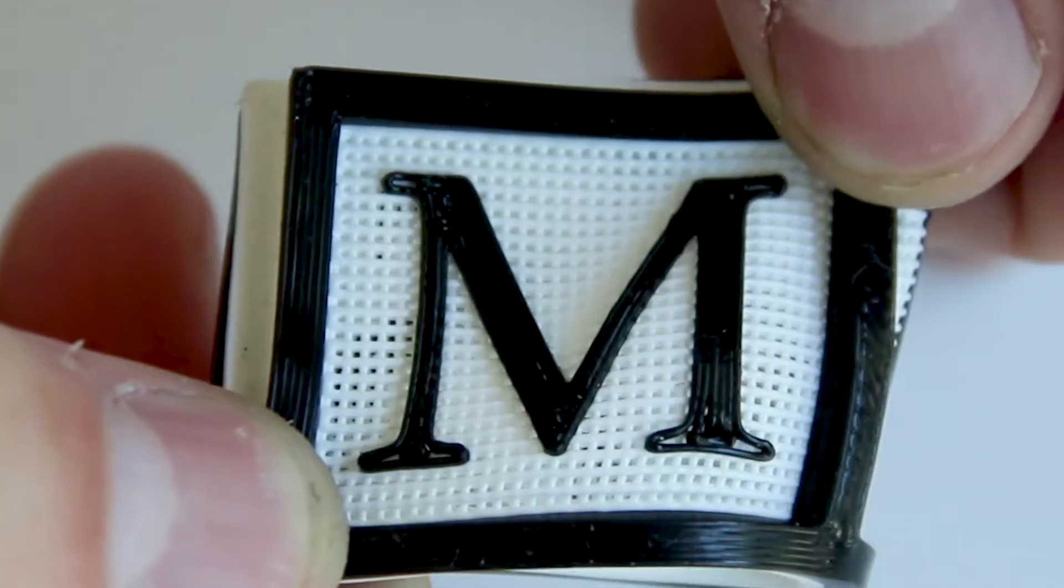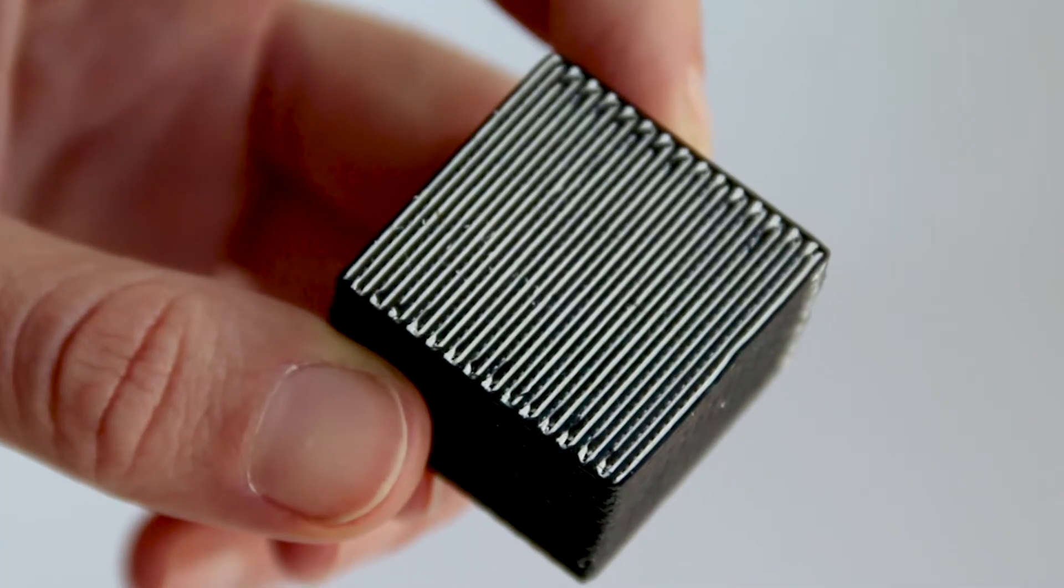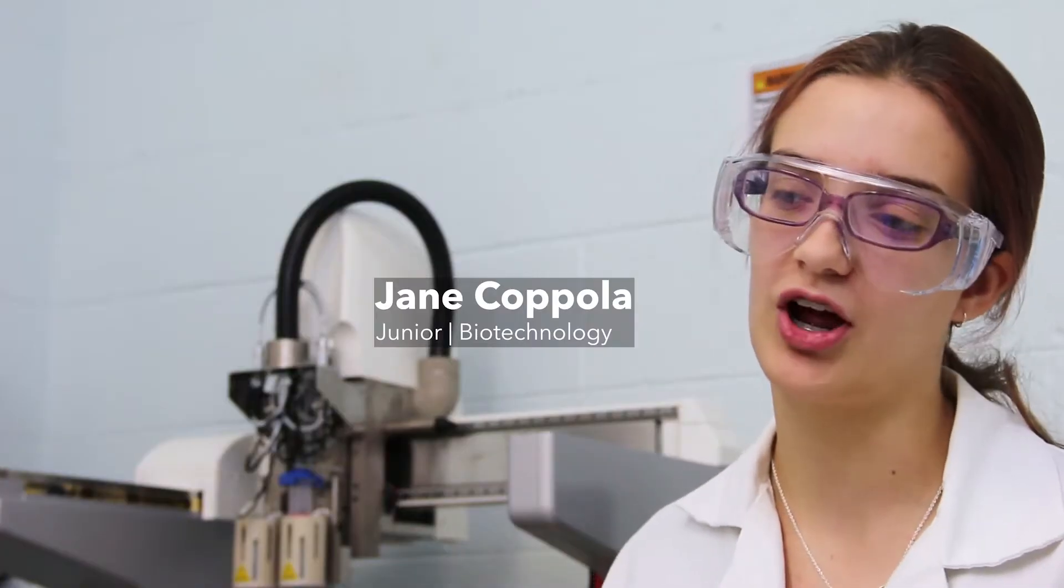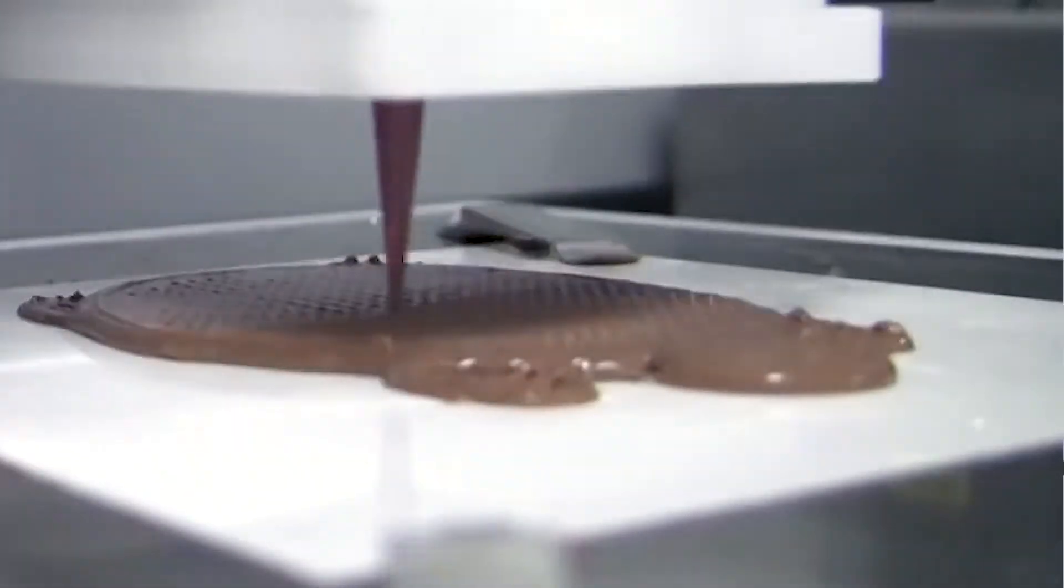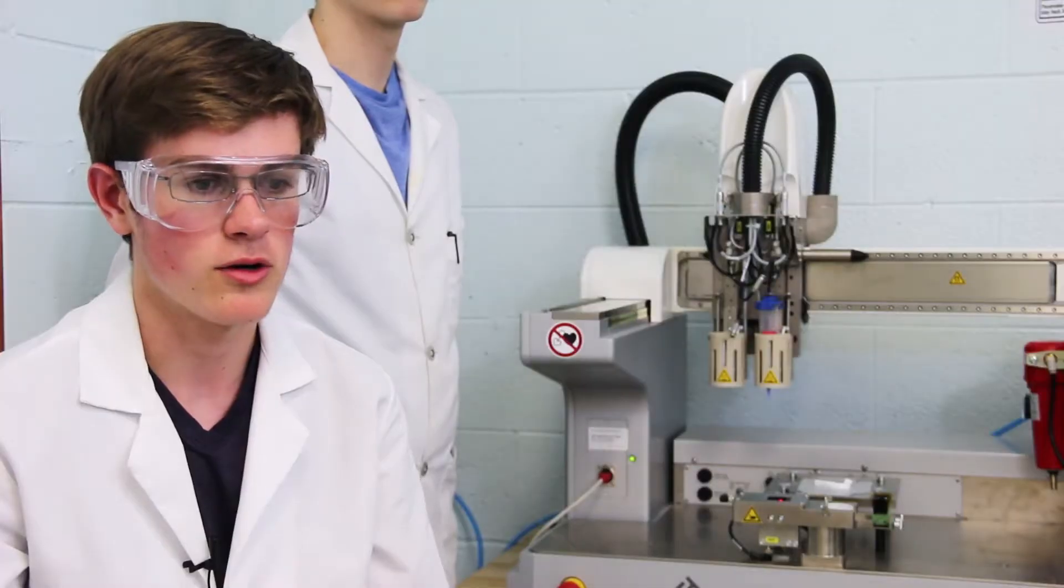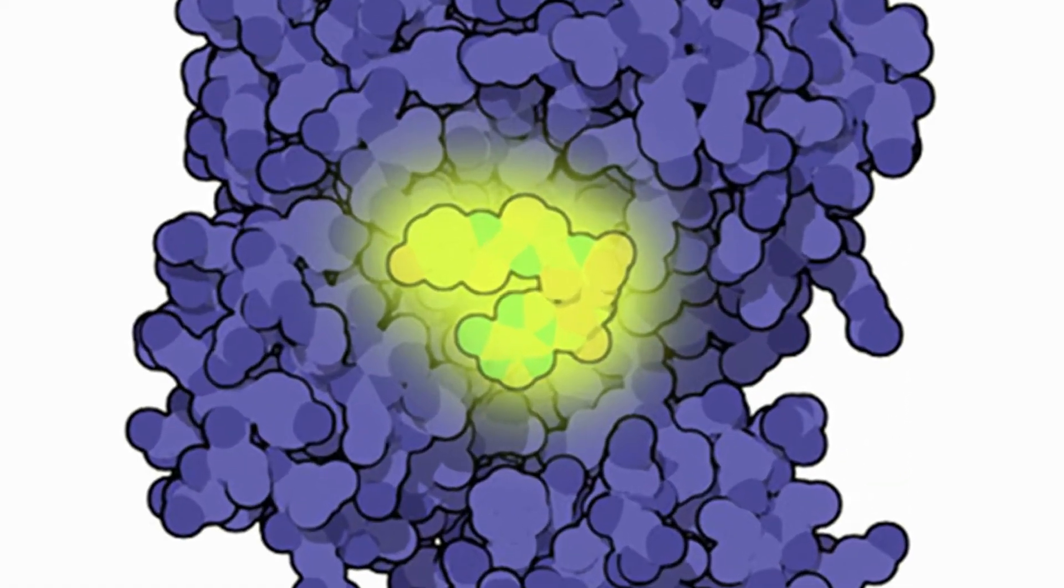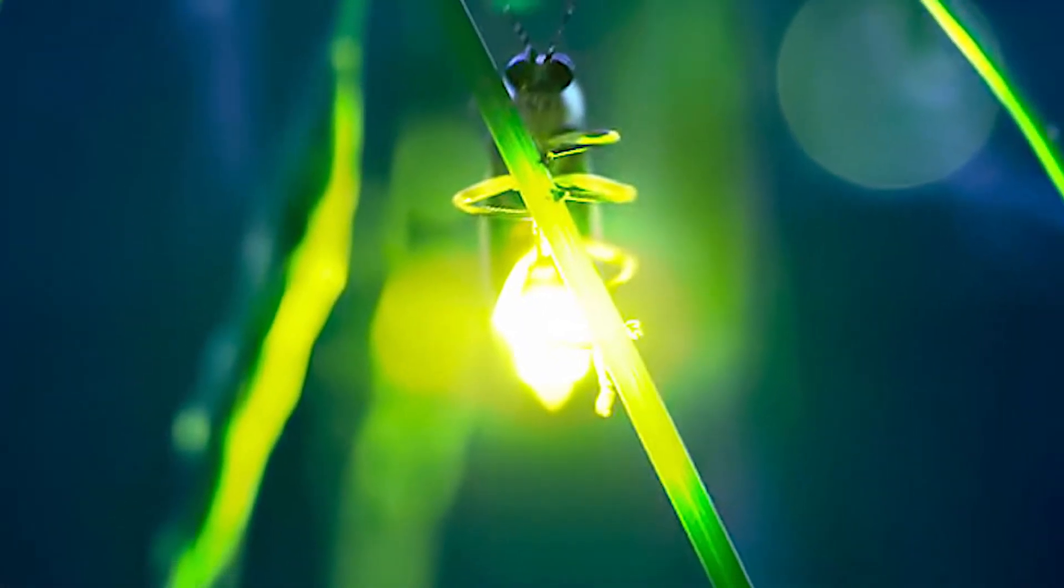We are still working on figuring out all the many different things we can do with the Bioplotter and making a nutrition bar using the different proteins. We want to try and incorporate the Bioplotter using firefly cells to create firefly luciferase, which is the part of the firefly that makes it glow.